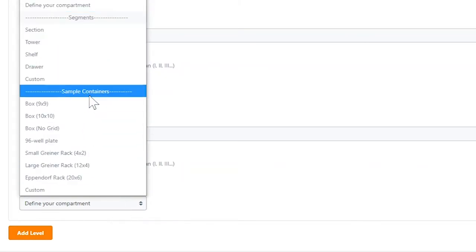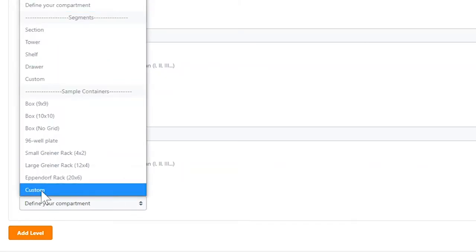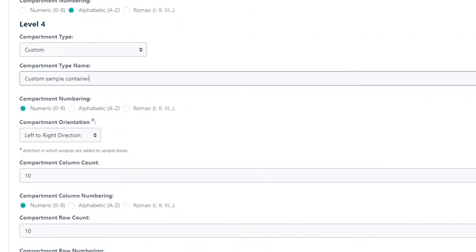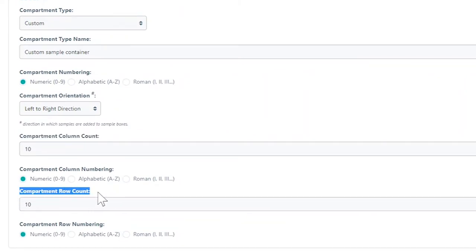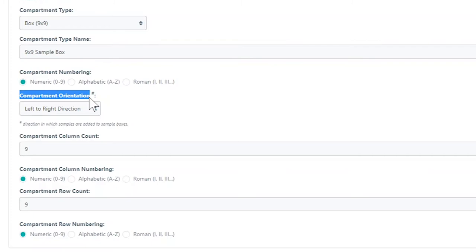You may also create a custom sample container type. To do so you must define the column count and row count. When more than one sample is added you can define the compartment orientation to indicate the direction in which samples will be added.